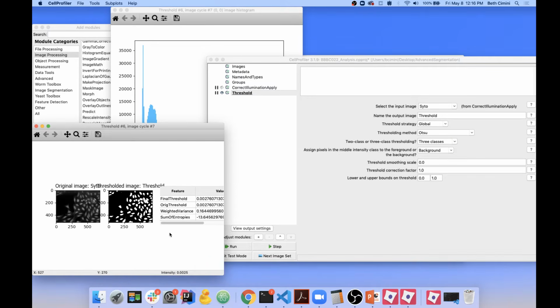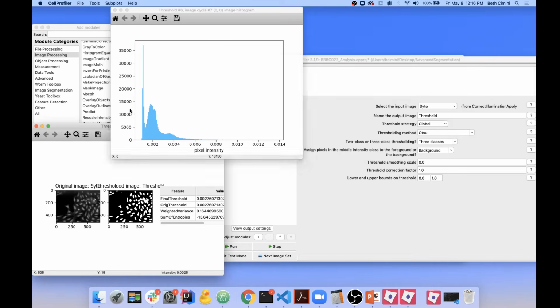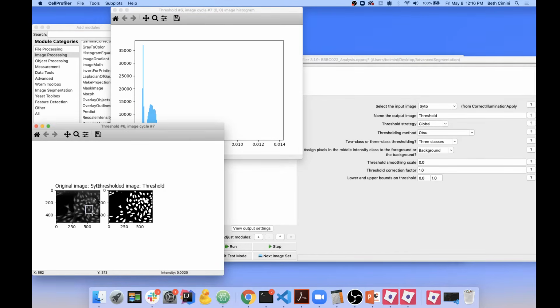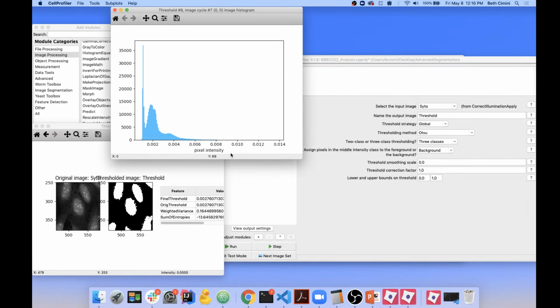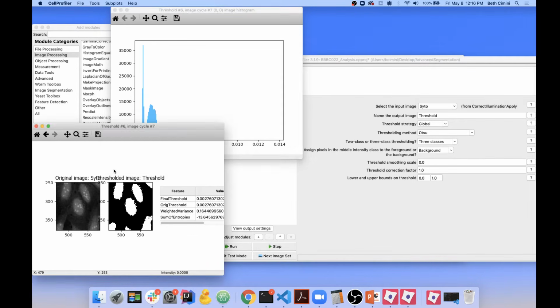What we have here is actually something that looks kind of like the nuclei, because it turned out our three peaks here are the background, that cytoplasmic signal we could see when we blew the image way out, and the nuclear signal. Our fourth class here, our fourth brightest class, these actual small little dots, actually don't even register as enough of a class for Otsu to see them. So if we wanted to find these nucleoli, how would we do it?